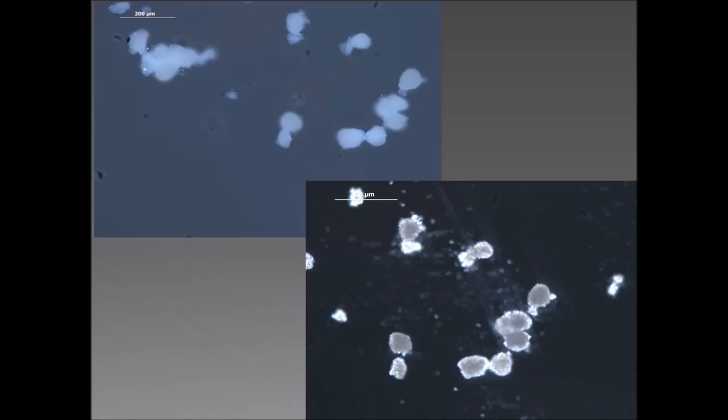This is after 5 minutes. After 5 minutes you find that this birefringence becomes stronger and more intense, so you know that the particle has changed from amorphous to crystal when in contact with water.